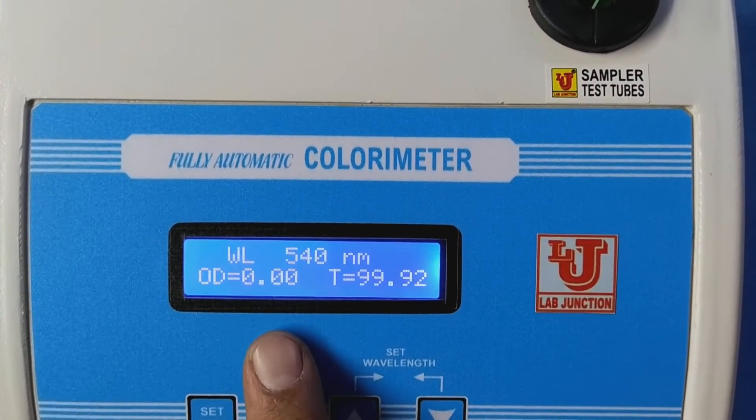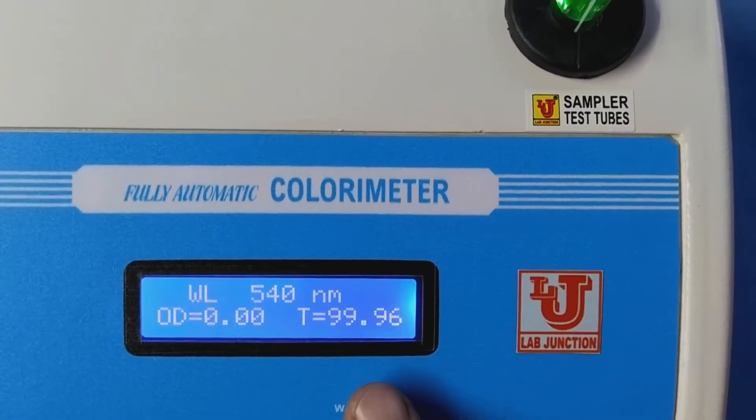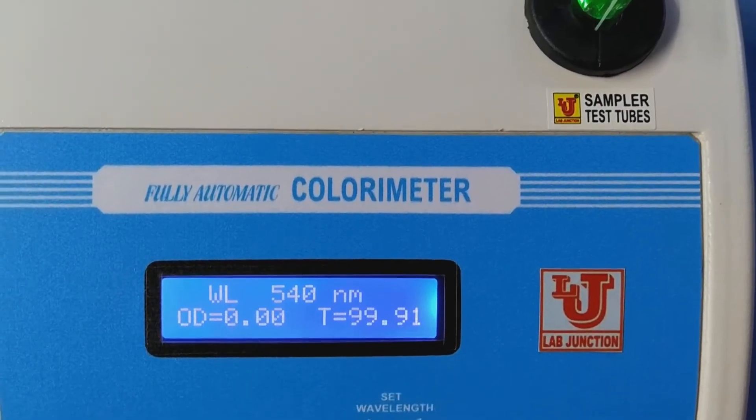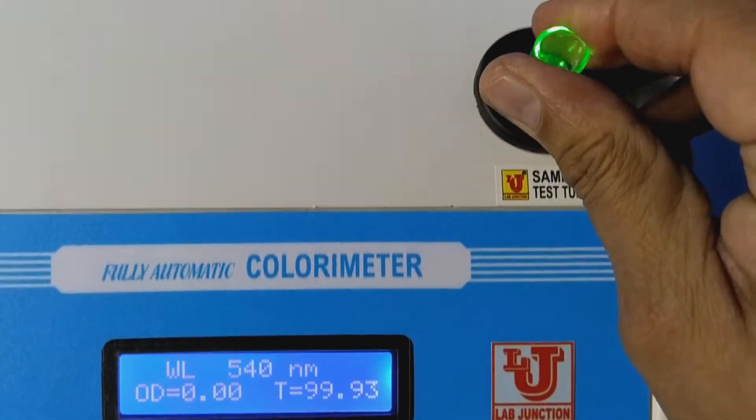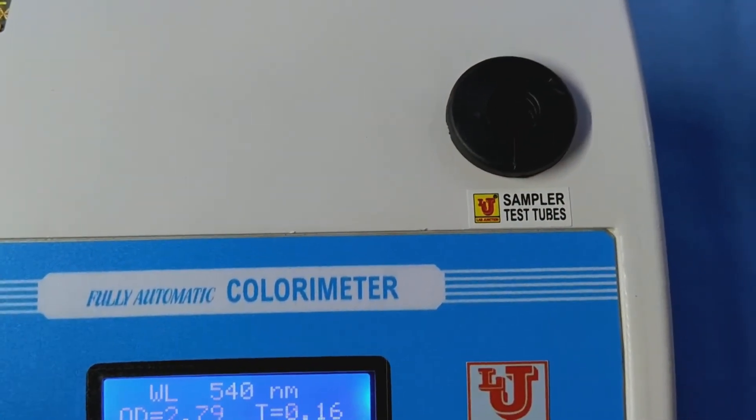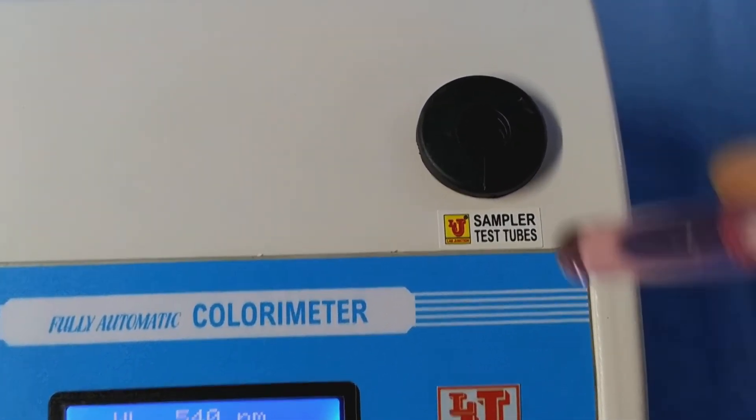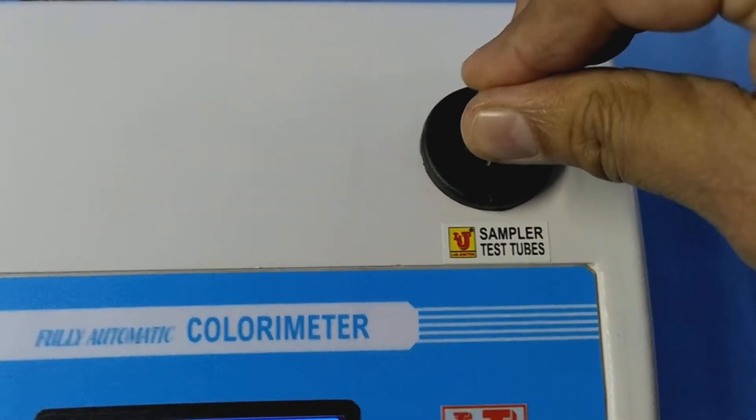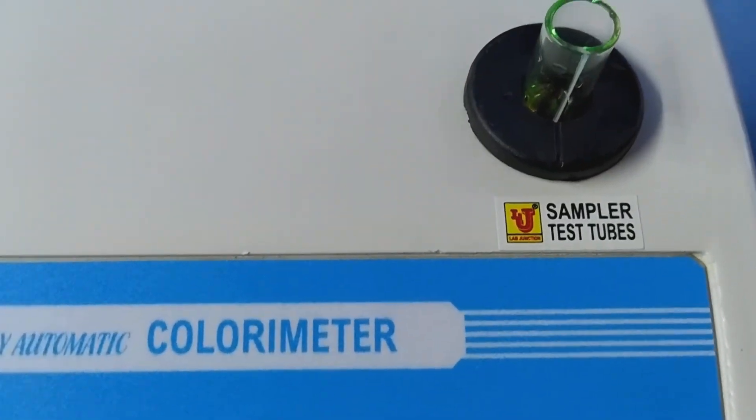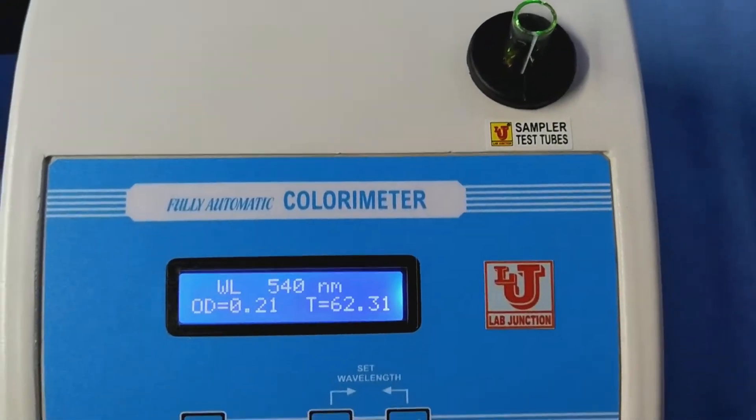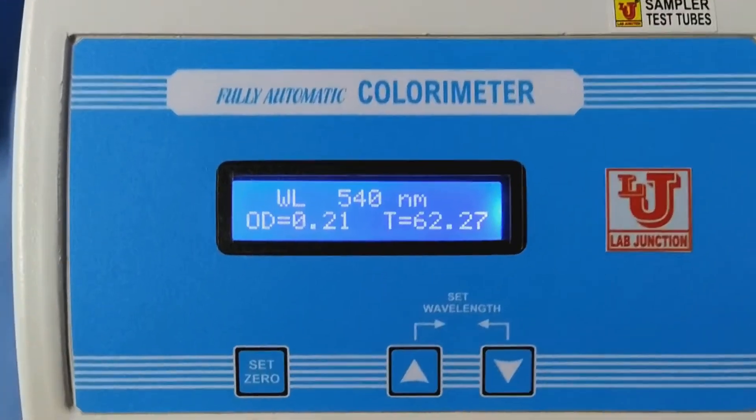Now, your absorbance is 0.00, transmission is 99.94. Now, replace your sample and insert in the test tube holder. Now, your absorbance is 0.21.